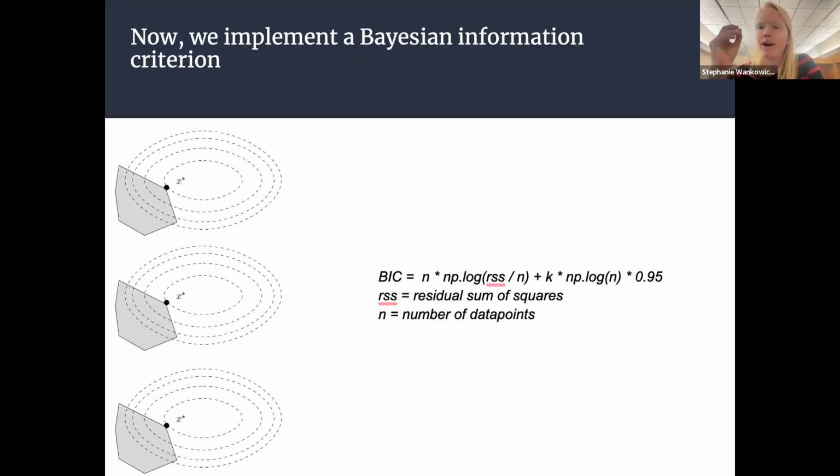This is really because the algorithm is built to best explain the electron density. We tell it that it can fit up to 5 different conformations, and that's because a lot of times 5 different conformations are needed to explain the very, very complex signal in the underlying structure. But oftentimes, if you give the model the ability to model in 5 different conformations, it overfits. And so this is just punishing the model based off of this K parameter, by the number of atoms and the number of conformations that exist in the model.